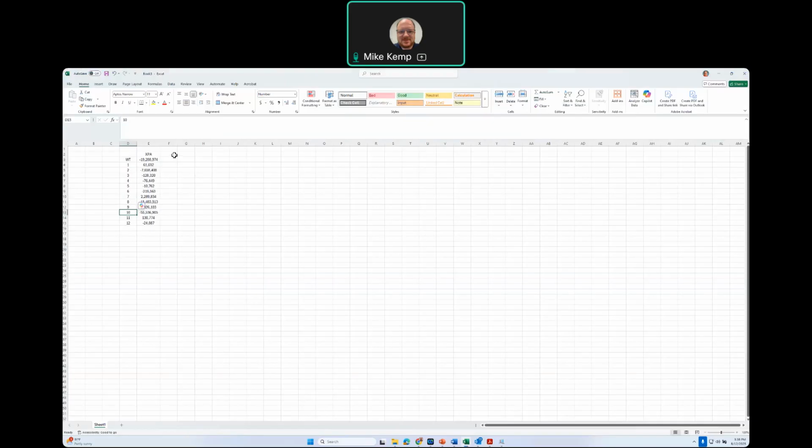Ultimately, we're going to do the same thing with the Ponceau stain. That'll also generate a negative number. And then we will normalize things. Some of these samples have positive numbers. You can't have a negative intensity. So if it becomes positive, it just means the signal is so low it's less than the average background signal. So basically, we'll just call that a 0. So anything with a positive number, we're going to say 0. And ultimately, looking at the blot, we'll see there's no band there. These are just numbers. The numbers should make sense visually based on what you look at on the Western blot.